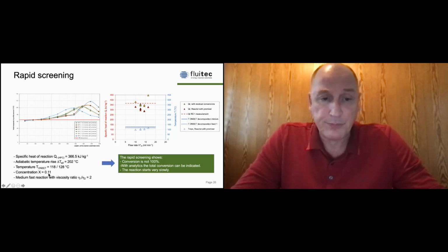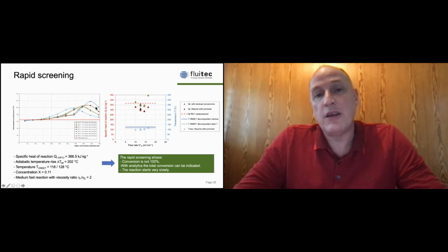So this diagram that you see here is interesting because you see I have this temperature profile, and this might be perhaps almost continuous, almost a complete conversion, but probably not all. Here you can see the reaction has not finished yet. You can see that all the temperatures were running under the decomposition, so we do not expect any side reactions or decomposition reactions.